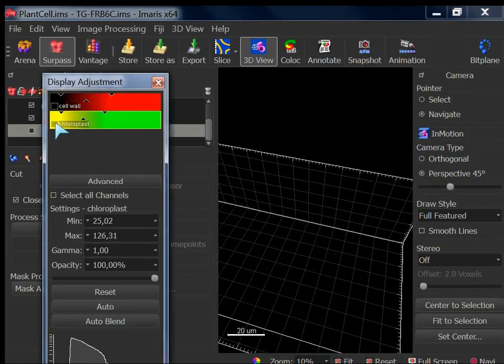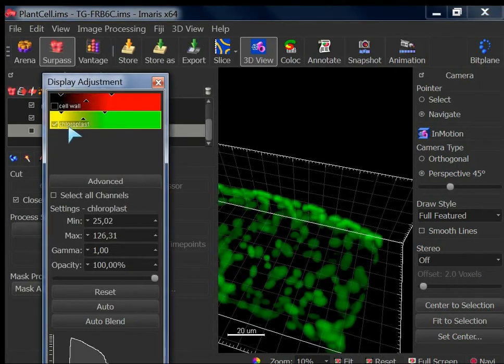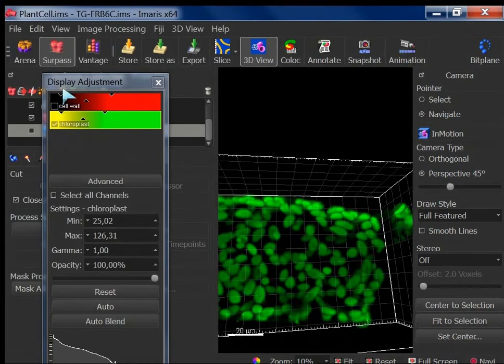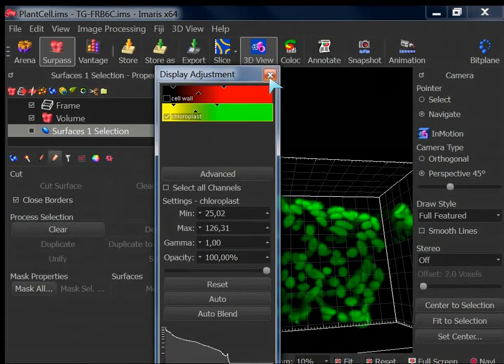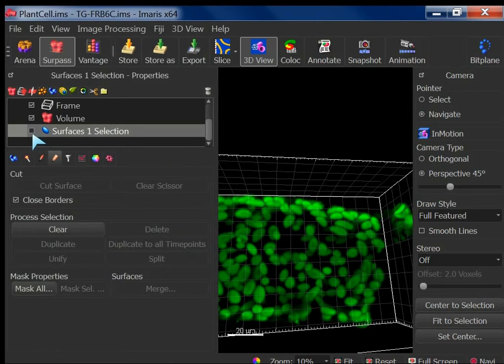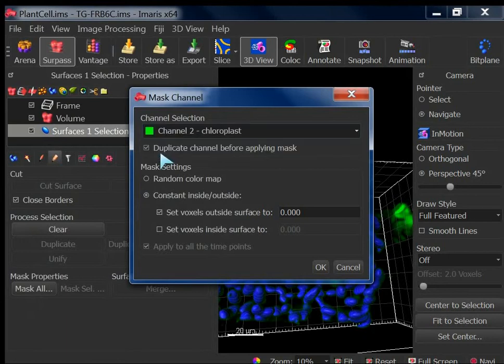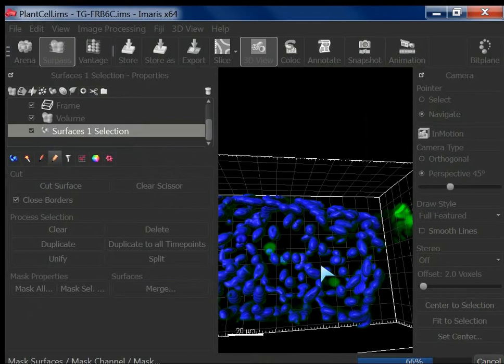And let's do it for now. But now I can't do it because I think yes, Control Z, that will work. Yes, good. Normally you duplicate that. Yes, normally I think you must duplicate all the time. So go here, apply it on channel number 1, duplicate it here. Let's see, okay.